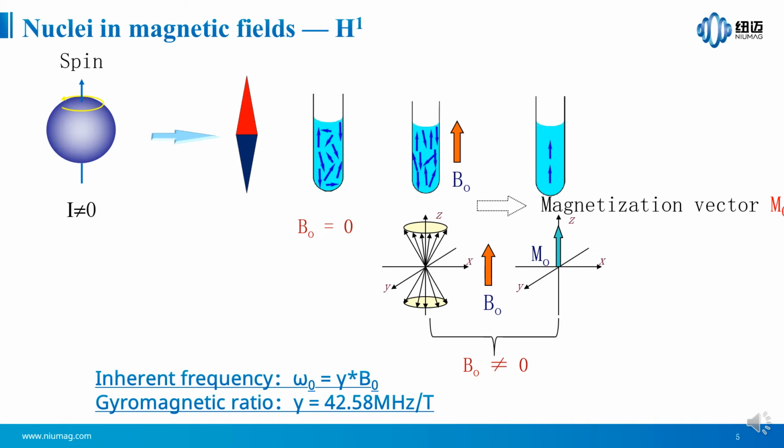As some of you may know, NMR is called in two different ways. You can call it a half Tesla NMR machine. A half Tesla refers to the strength of the magnetic field. Another way to call it is a 21 megahertz NMR machine, which is actually the resonance frequency of it. Of course, this is the reference frequency of hydrogen nuclei.